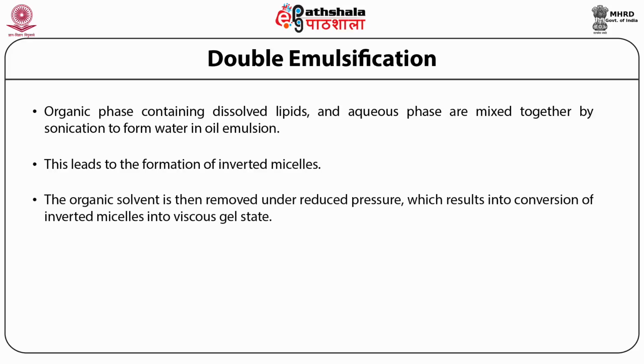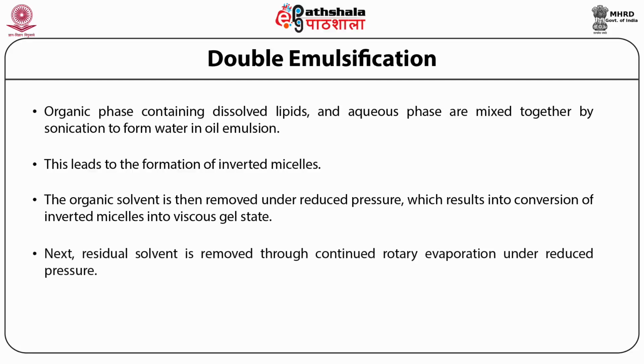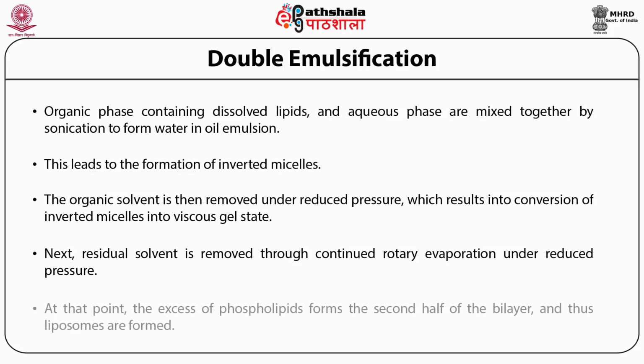The organic solvent is then removed under reduced pressure, which results in conversion of inverted micelles into a viscous gel state. Next, residual solvent is removed through continued rotary evaporation under reduced pressure. At that point, the excess of phospholipids form the second half of the bilayer and thus liposomes are formed.